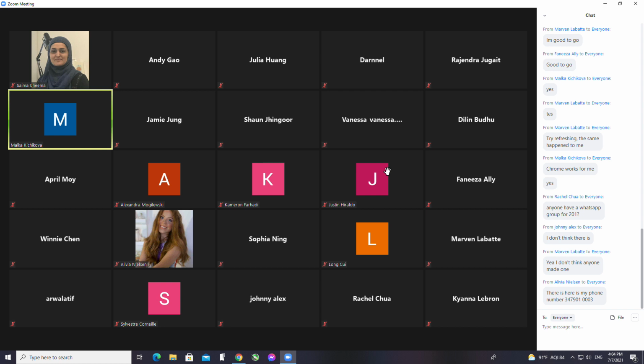Sorry, Dr. Chima, I'm not understanding that last part. So what April said was that she could be counting, say, 10 divisions on the ocular ruler and figuring out how many of the stage ruler divisions equal 10 on the ocular ruler, whereas you could be counting 80 and figuring out how many are there in 80, but because they're proportional, when you simplify it, the results should be the same.